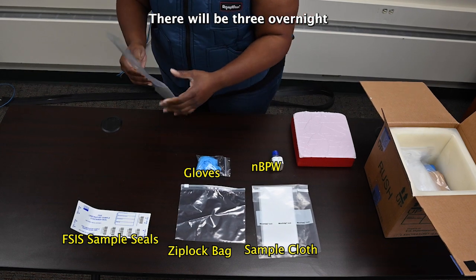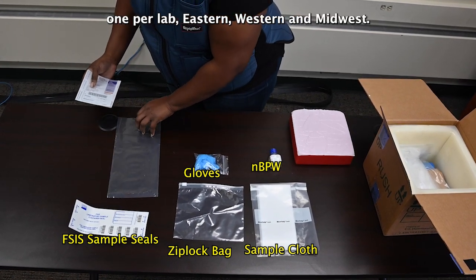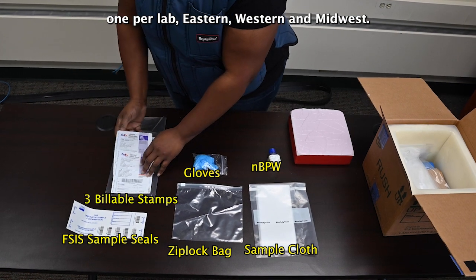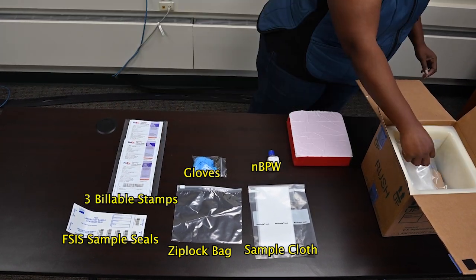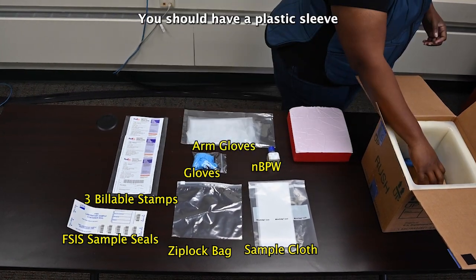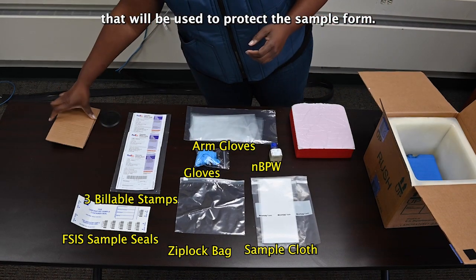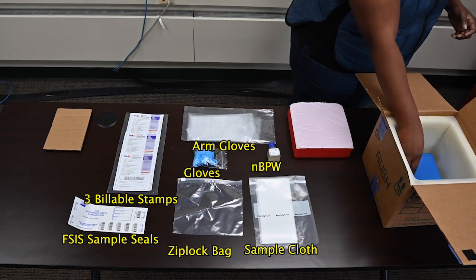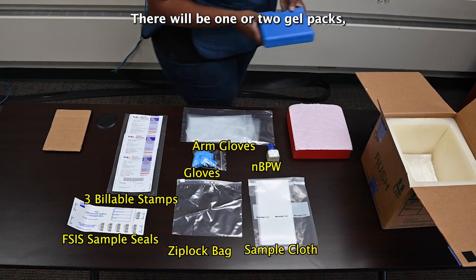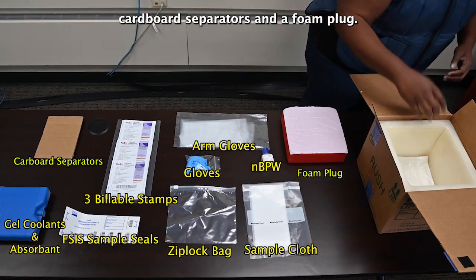There will be three overnight courier billable stamps — one per lab: eastern, western, and midwest. One pair of arm-length gloves. You should have a plastic sleeve that will be used to protect the sample form. There will be one or two gel packs, cardboard separators, and a foam plug.